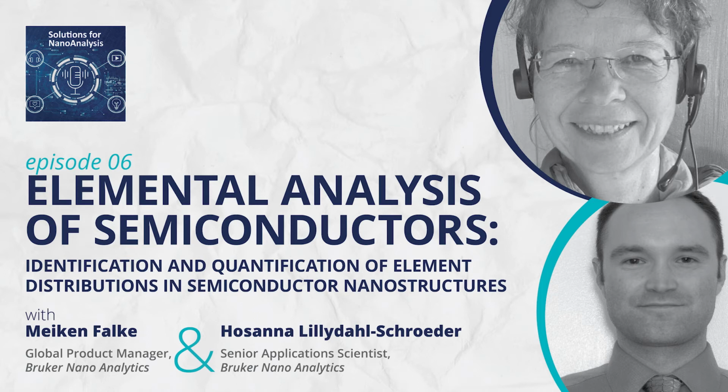Oh, that's quite a broad question. So I started out with TEM. So the length scales there, we are now at, I don't know which node, but we are talking about a few nanometers. So if we want to judge the functionality of the devices on the nanometer scale, we need to analyze at least one order of magnitude better.